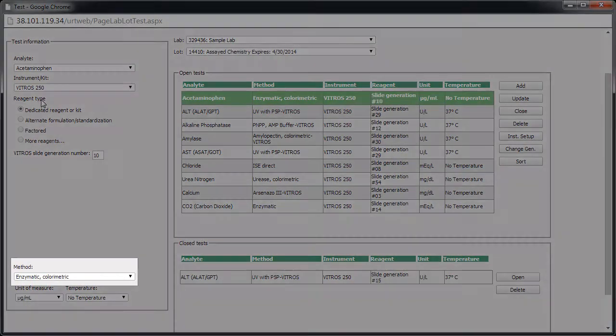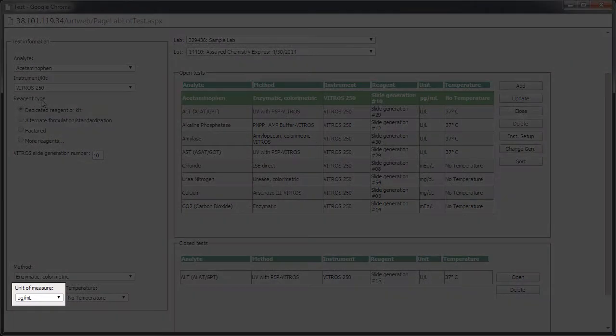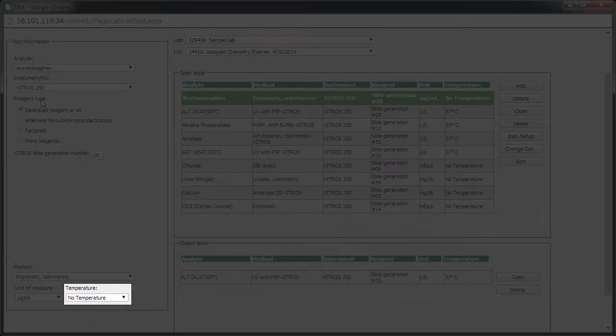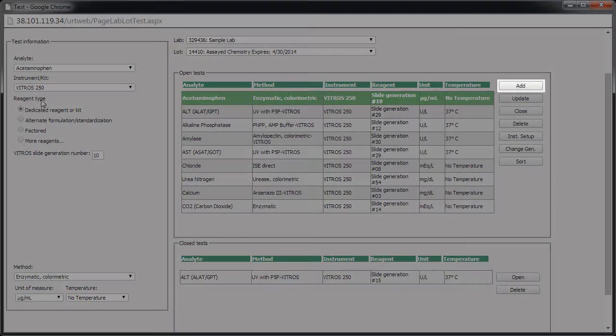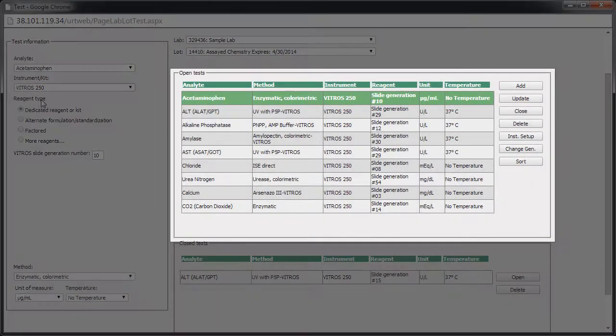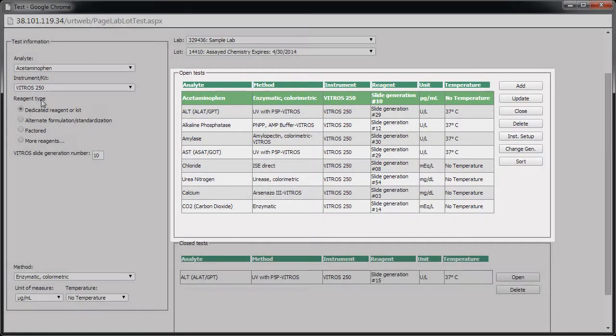Then select a method and unit. You may set up tests that are qualitative or semi-quantitative if the test exists in the database. Contact Biorad if your test is not listed. Finally, select a temperature. Click Add. The new test appears in the Open Tests list.